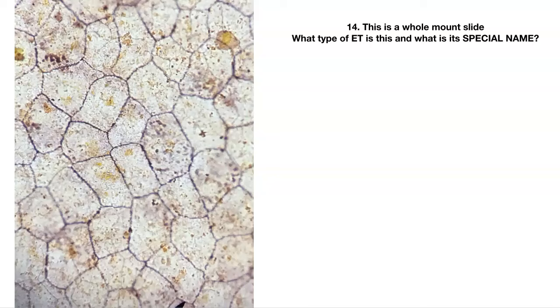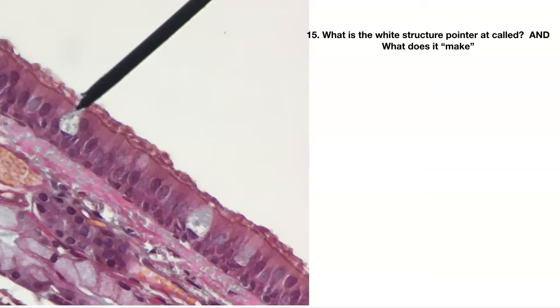Number fifteen. The pointer is pointing at that white structure — what is that structure called, and what does that white structure make?